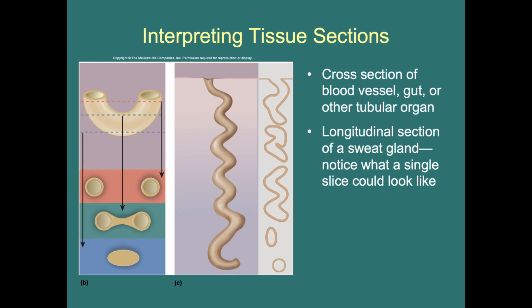So here at the green line, right in the middle of our macaroni, we can see that we have these circles that are kind of connected. And then if we look down here at our blue dotted line, we get sort of this oval shape. So 3 different views of the same noodle, and they all give us a little bit of different information, so we can sort of put all these images together.